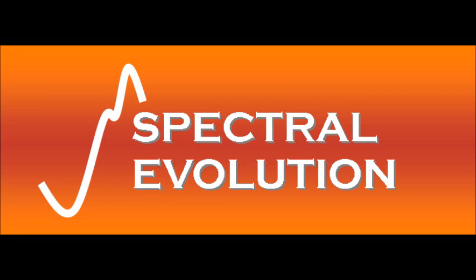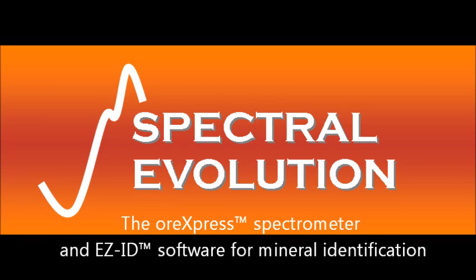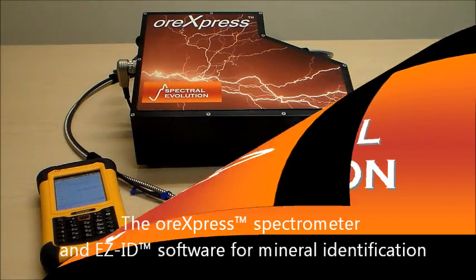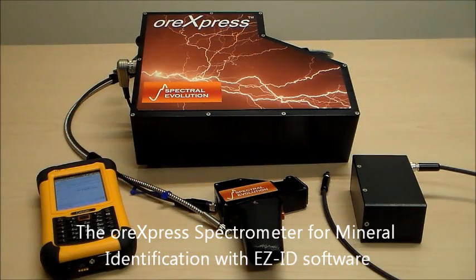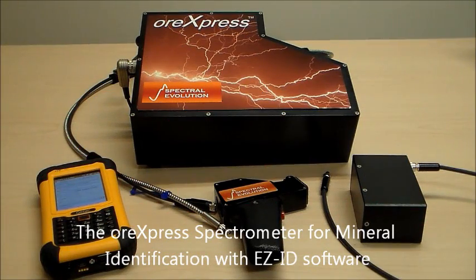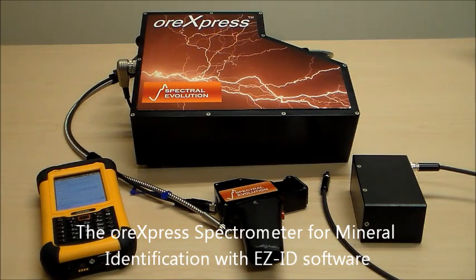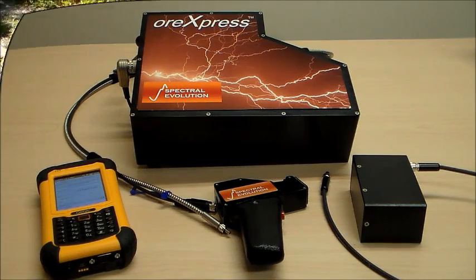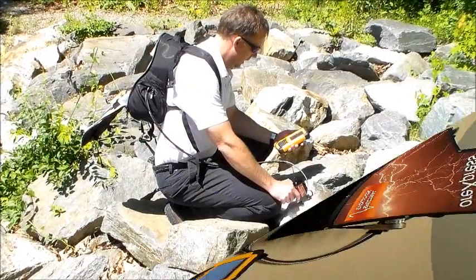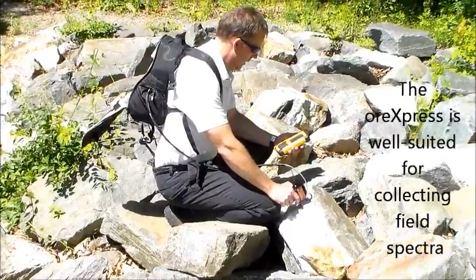The ORExpress is a field portable spectrometer for mining exploration used to detect and identify minerals of interest. The ORExpress and EZID software provide an ideal combination of field portable NIR spectrometer and mineral identification software for mining.